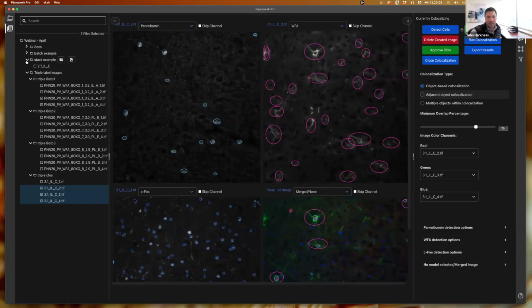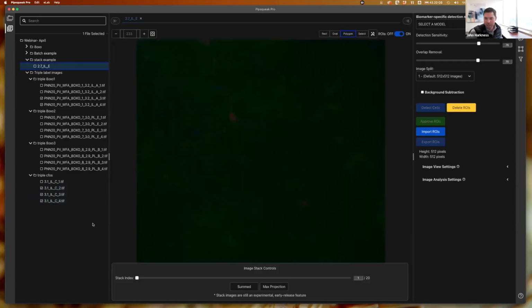Great question. Yeah, thanks for reminding me. I actually glossed over this and forgot to mention it. All of the images that I've shown you so far are collected from a confocal. Pipsqueak works great with fluorescence microscopy or even bright field, so any of that's fine. A lot of the work that I did in my postdoc looked at Z thicknesses of around 10 microns. We've certainly worked with labs that are much thicker or much thinner than that. We don't have any problem with that.